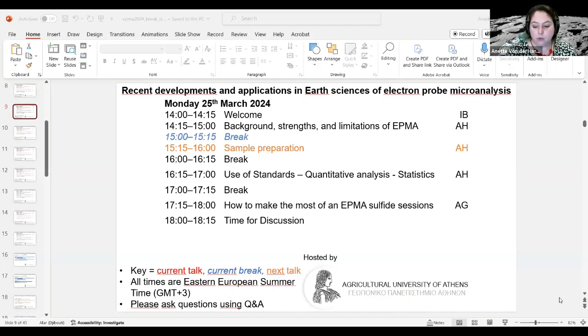And then I might also check an element on the PET, like calcium or something. And if those don't drift, the likelihood that any of the other ones drift is much lower. So if you want to cut time, that's definitely a good approach, to start with the usual suspects first.